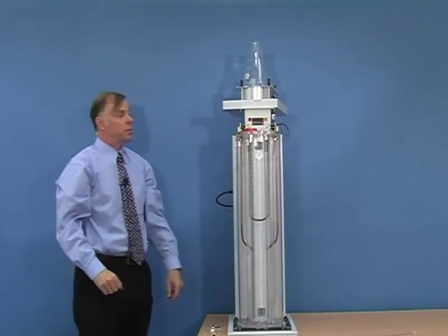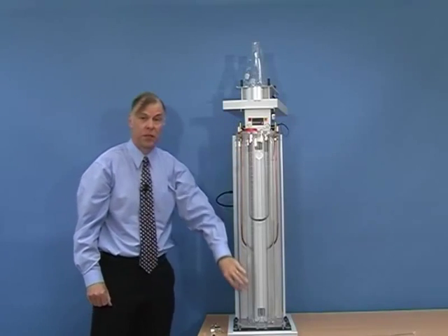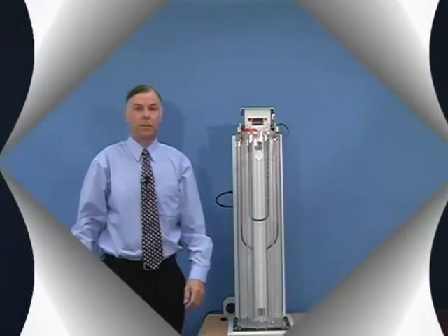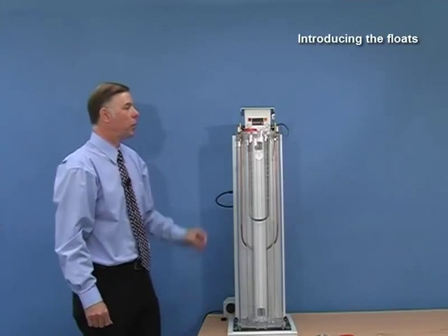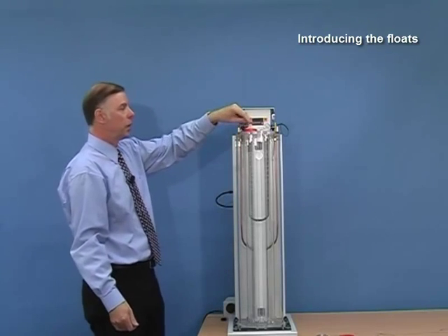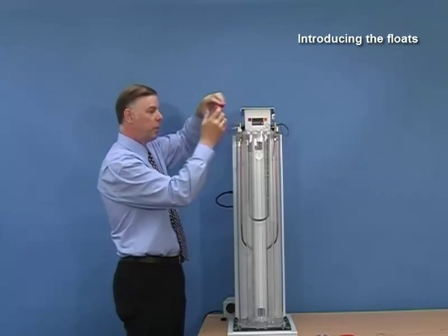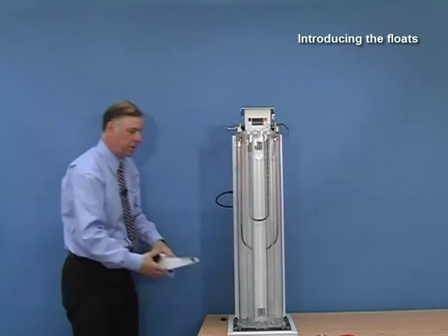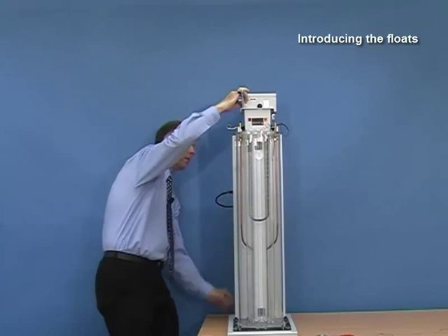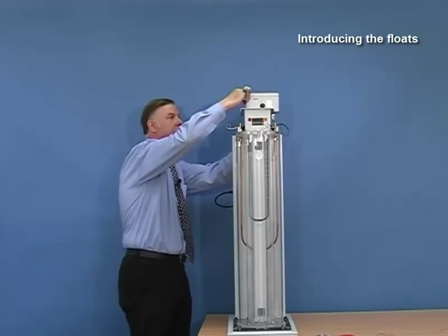Before we can use the density column, we have to allow time for it to stabilize, and then we add the floats to indicate the reference points. Now that the density column has been made, we need to introduce the floats so that we can get accurate reference points. To do that we remove the clip — the tube is not going to rise anymore because it is now full of fluid — remove the cap, and fit the column sweeping mechanism onto the top of the unit. This mechanism is used to lower the basket into the column and it moves at a very slow speed, taking about 40 minutes to reach the bottom, so that it does not cause any disturbance or change of the column.